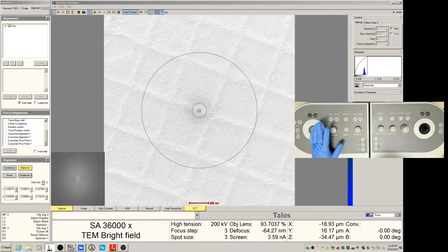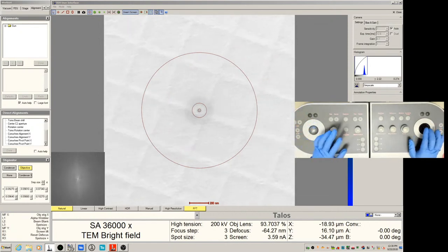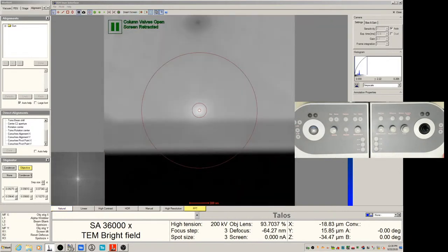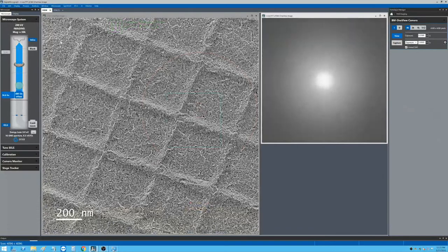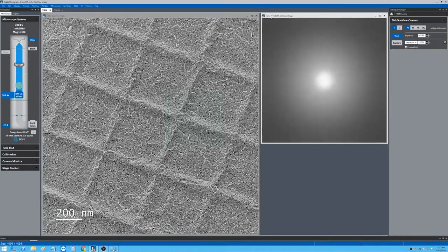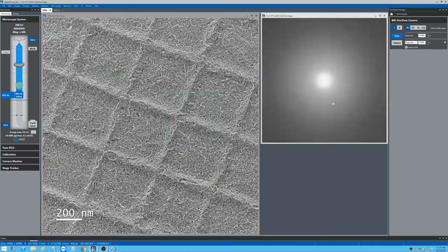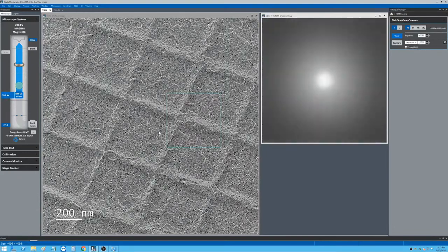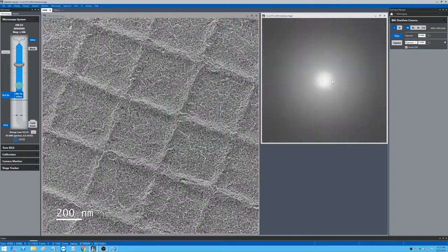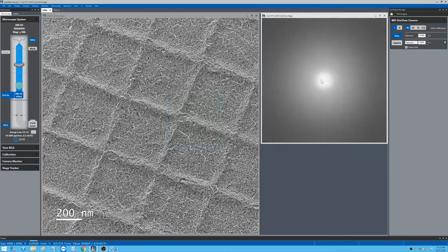So we will just go back to the flu cam to set up everything, find the region of interest. Then let's press the R1 again and go to Gatan. Now this image will show up on Gatan. So right now, if you take a look at the Fourier transform in here, you don't have the rings because right now we are at a lower mag. So then there is no way to tell the focus point on the live FFT.